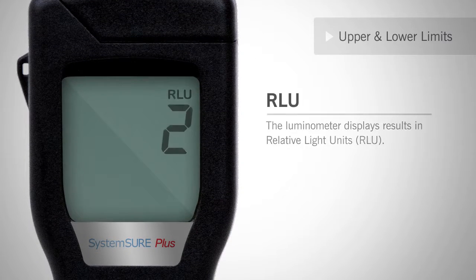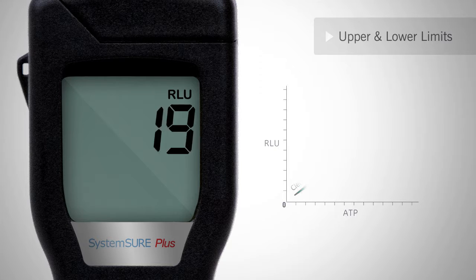Test results are measured in relative light units. RLUs are a unit of measure for adenosine triphosphate. The scale varies depending upon manufacturer, but the greater the amount of ATP, the greater the RLU number.